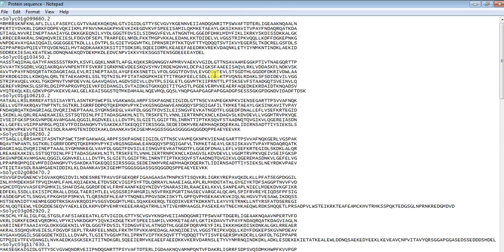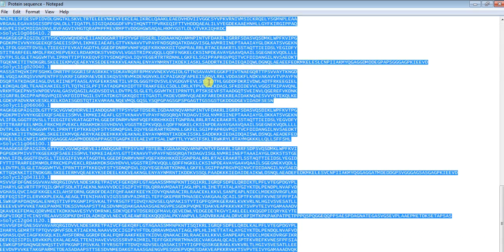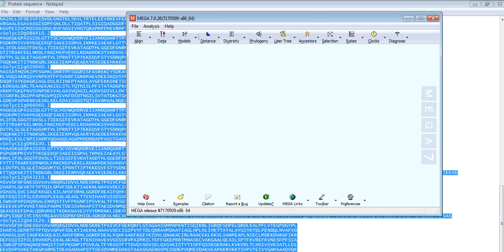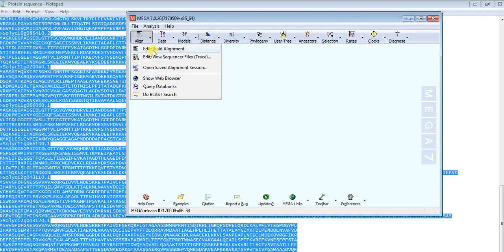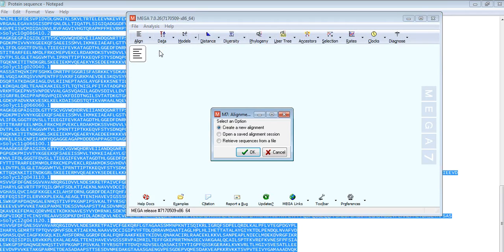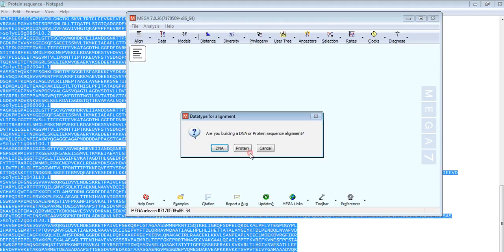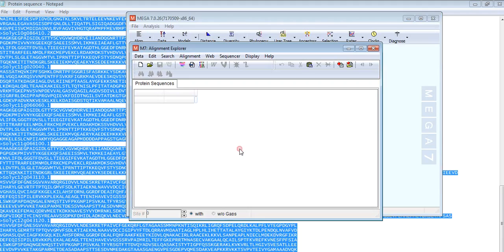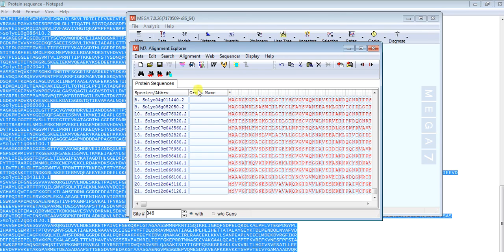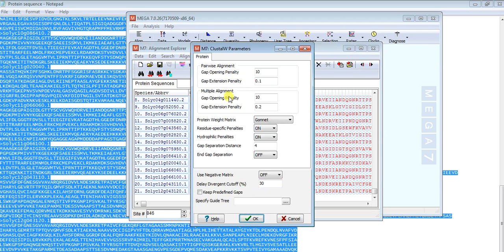First, we do the alignment of these proteins. Collect all copies, open MEGA, go to align, edit/build alignment, create a new alignment, select protein, and paste your sequence. Then align protein, okay.